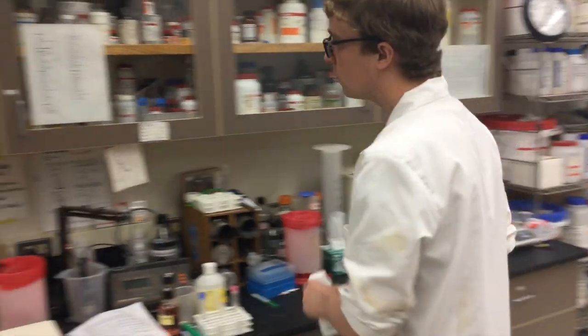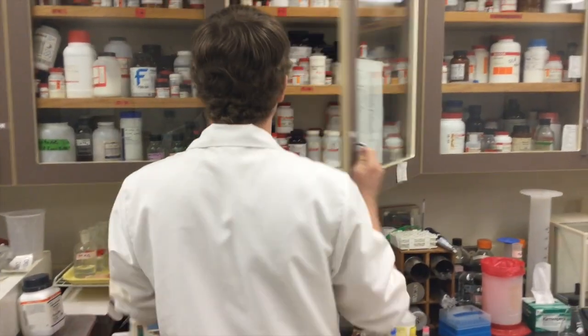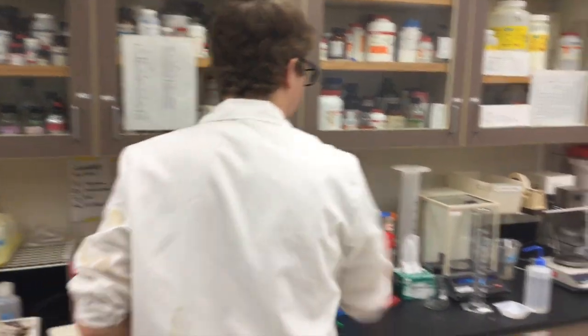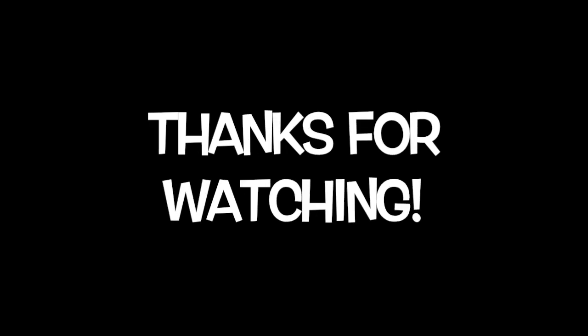Once you have finished, return all of your materials to their proper place and clean your workspace thoroughly. Now you have learned how to carry out the common laboratory procedure of calculating and creating a molar solution.